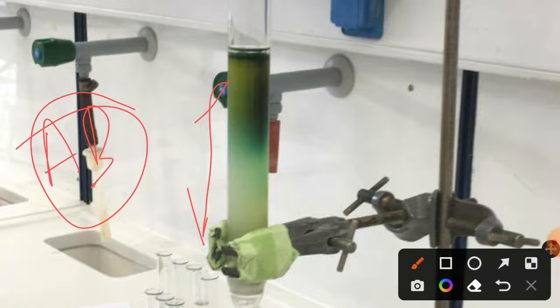And most importantly, it takes a larger time for preparation, along with it takes a good technical skill to perform. So those are the disadvantages of column chromatography. And now, what are the applications of column chromatography?